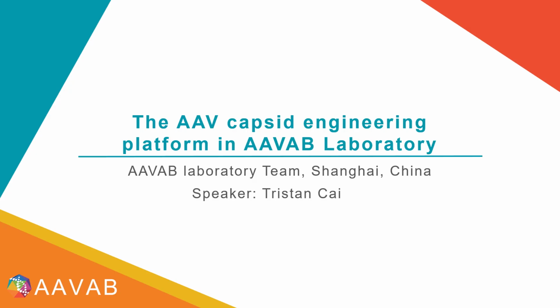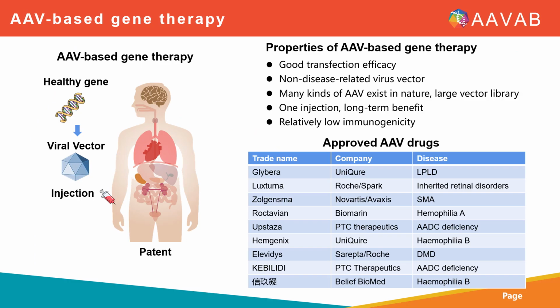I'm very glad to share our work about the leading-edge platform we built for AAV capsid engineering. Delivering healthy genes into patients is the basic idea of gene therapy. Very straightforward. AAV is one of the vectors to transfer genes into patients, with several advantages, such as good transfection efficacy, and it is not related to any human disease.